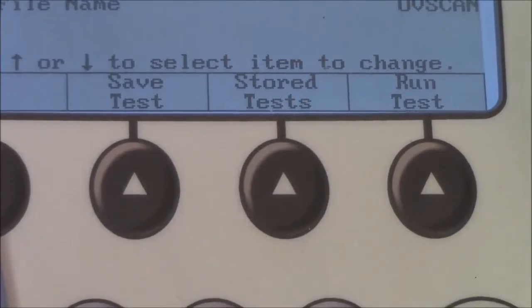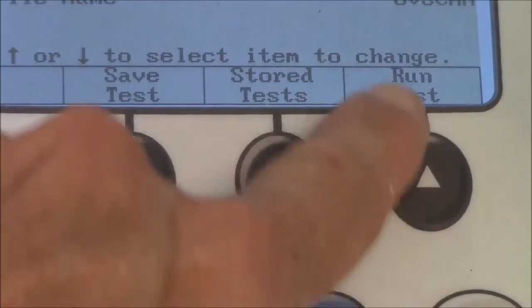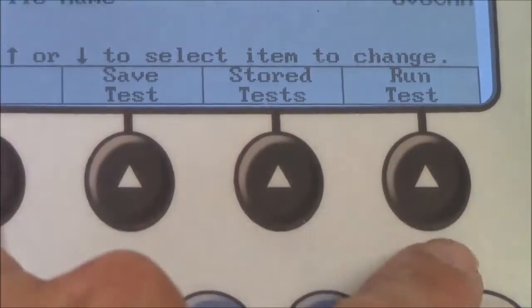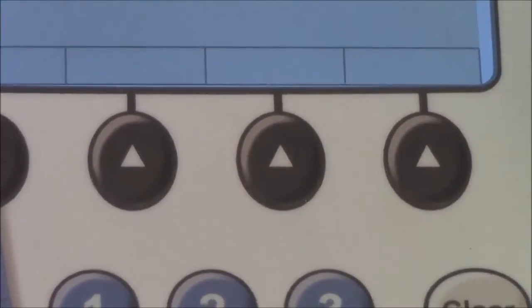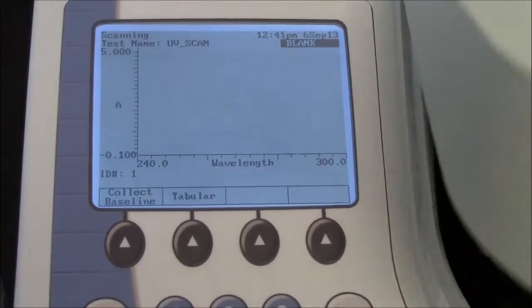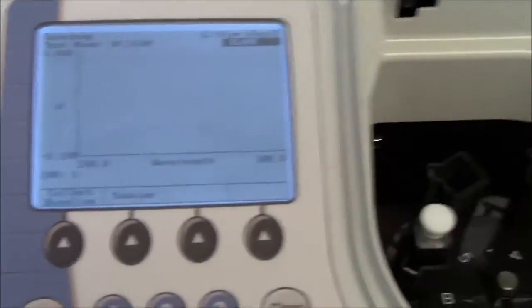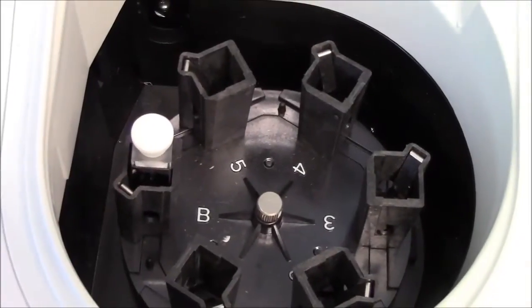Once I have set my wavelength range appropriately, I will use this button here. It says Run Test. So underneath the words, there is an arrow, and it's a button. The machine starts making some noises, and it automatically puts slot B in the light path.